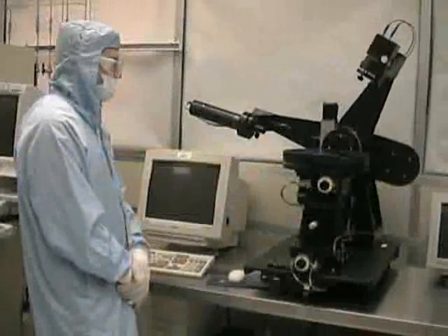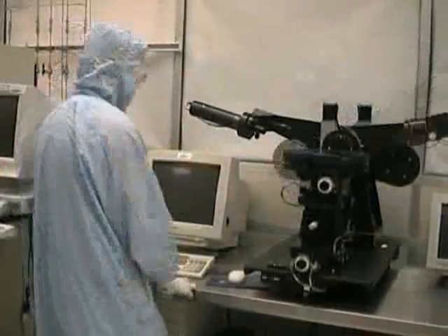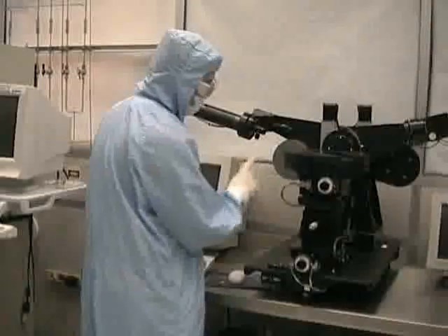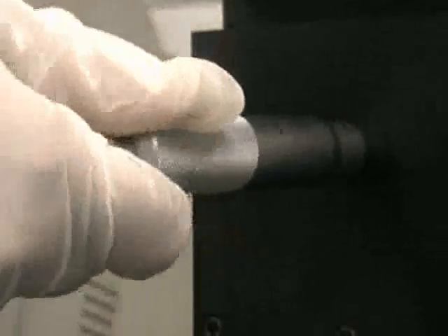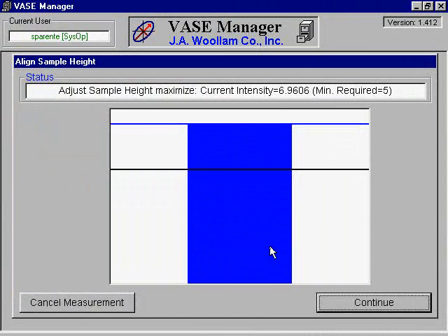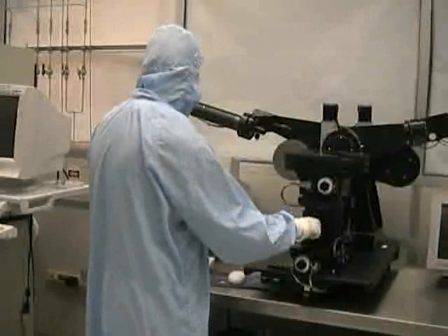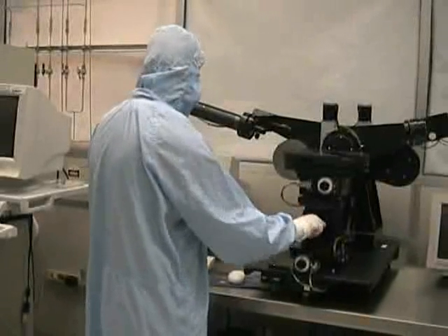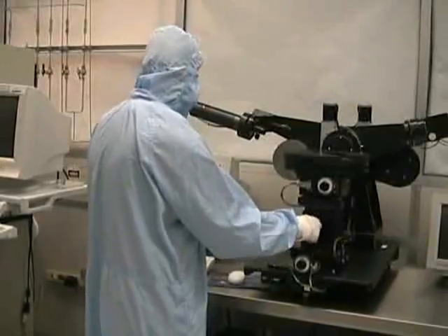The polarizer will then move into the scan position. For the next step, you should first make sure that the shutter lever is down and that the detector iris is open. You will need to adjust the intensity by rotating the height adjustment knob. Watch the blue bar and attempt to maximize the distance between the horizontal blue bar and the black bar by adjusting the knob. The intensity must be greater than 5 for the scan to take place. If it is still too low after adjusting the stage height, check again to make sure that the shutter on the analyzer is open. If the intensity is still too low, contact the MRC staff.